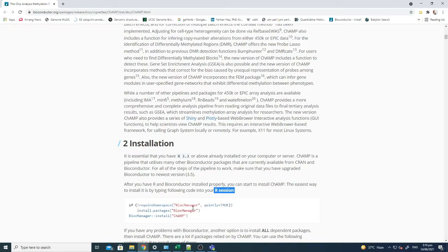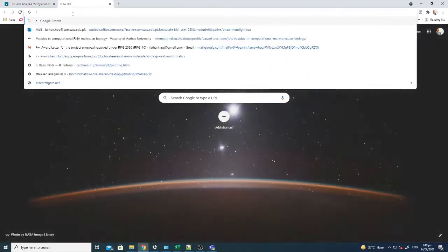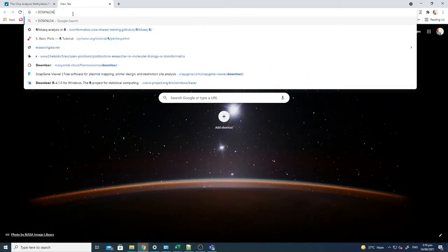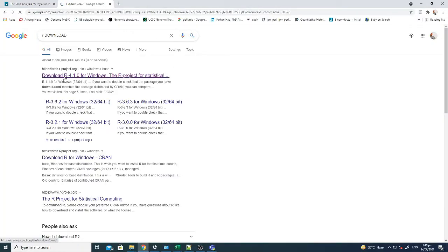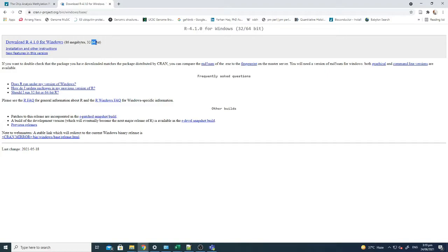Just go to the R website, you just have to write R download, and after writing R download you can download the latest package. When you download this, depending on your operating system, if it's 32-bit or 64-bit, just select the operating system and then download it.